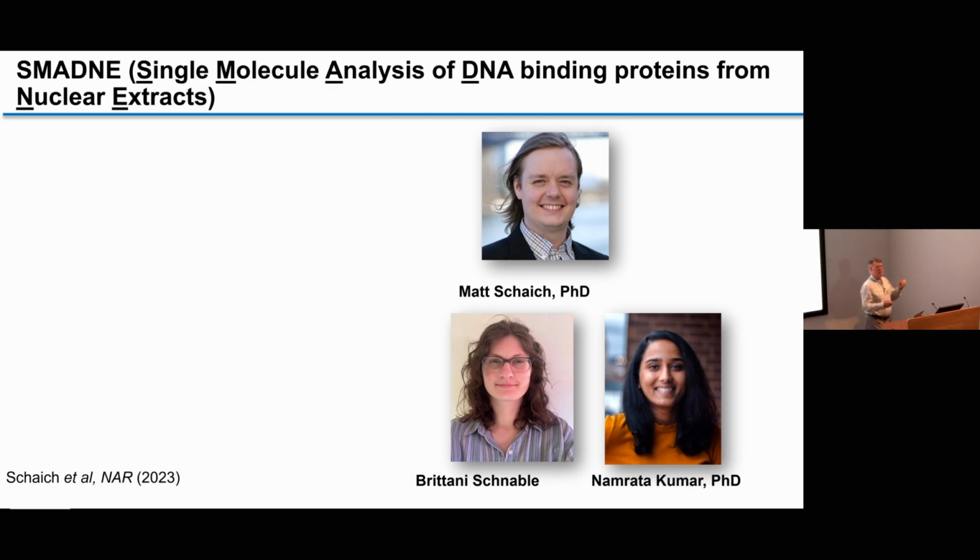One, you don't have to purify the proteins. You can generate variants very quickly. But also, we wanted to begin to look at other proteins that you would get in a nuclear extract and see how that would affect the events that you're studying.